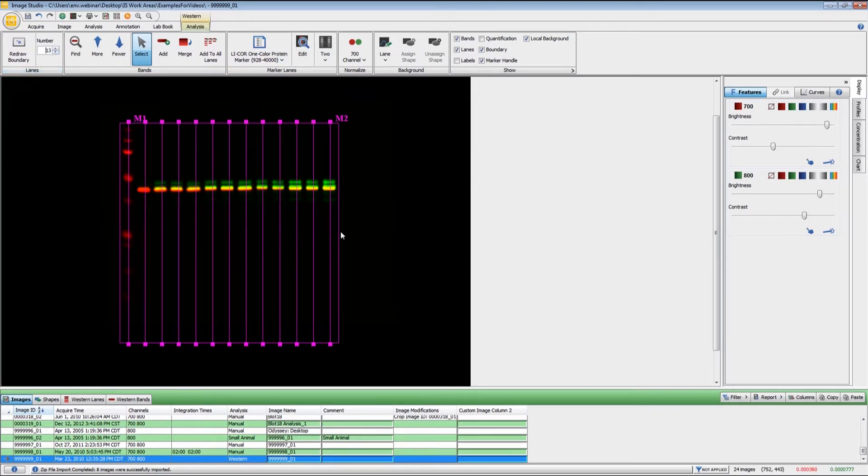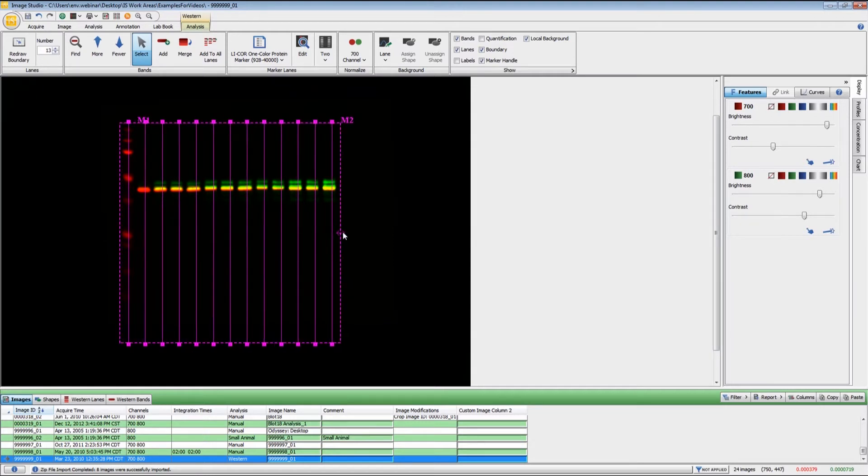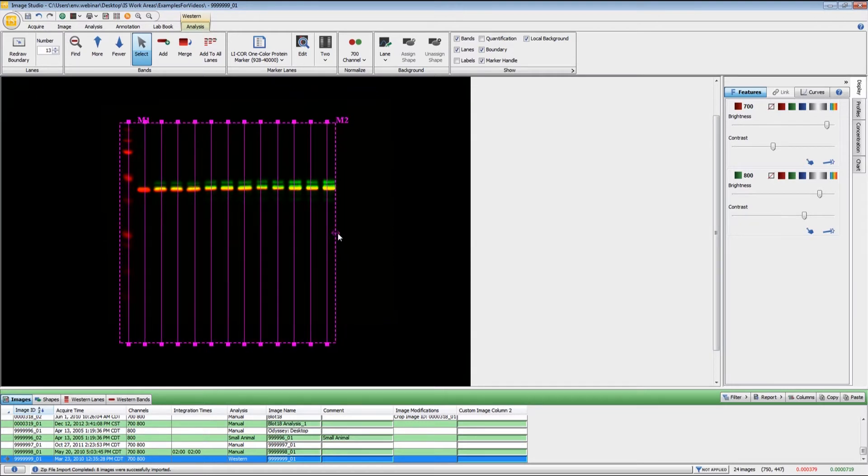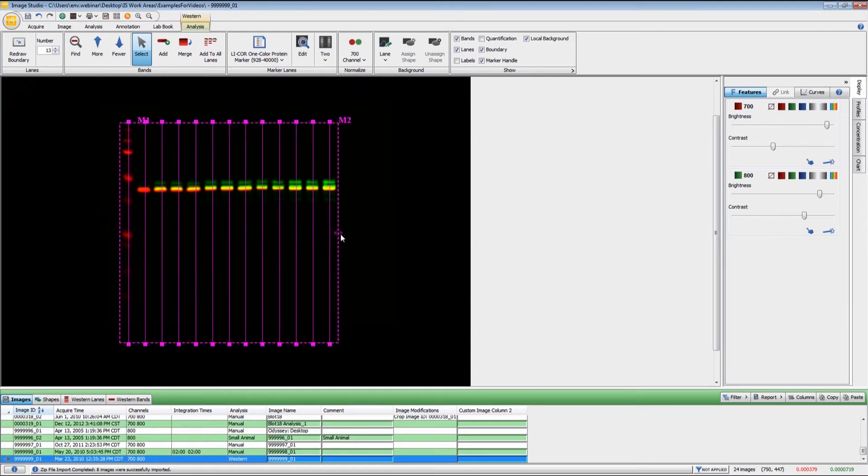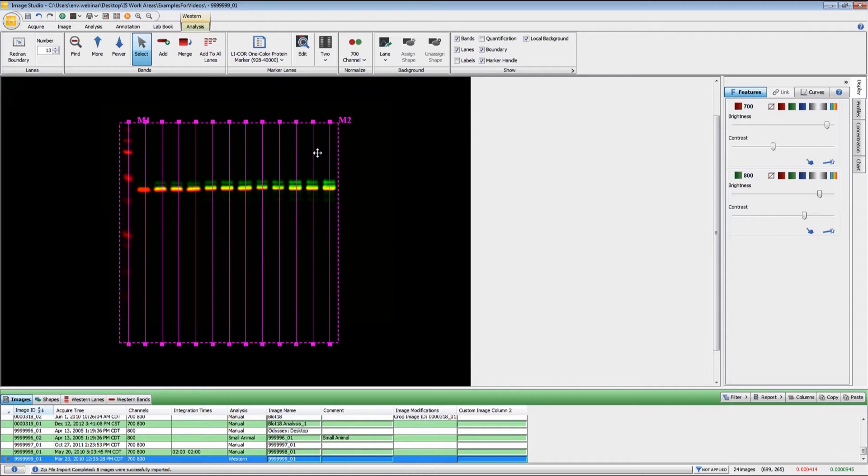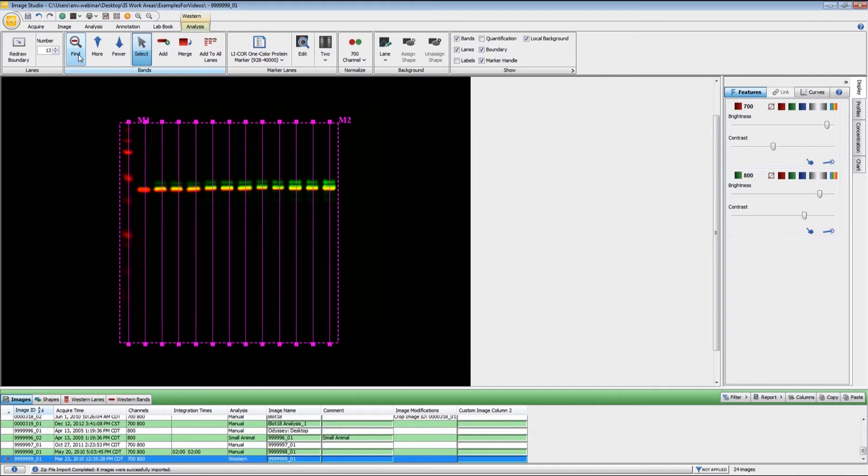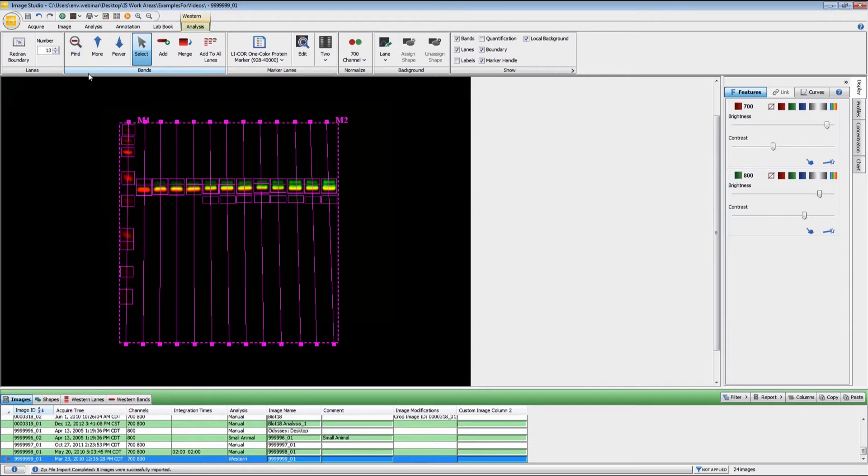Once you have that set, you can do some fine tuning. You may have to adjust the position somewhat. You want the lines to be going through the lanes or through the bands. They don't have to be going directly through the center, just somewhat close. When I do the band finding here, you will see that the position and slope of the lines has been adjusted to some extent.